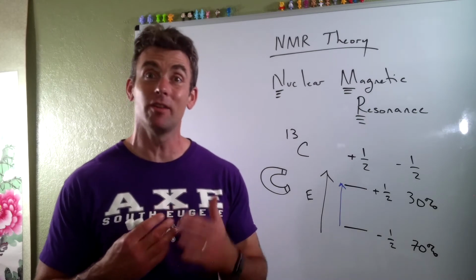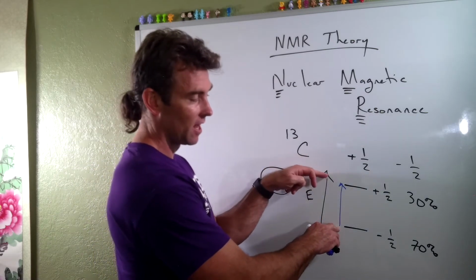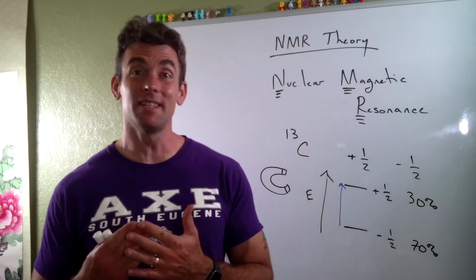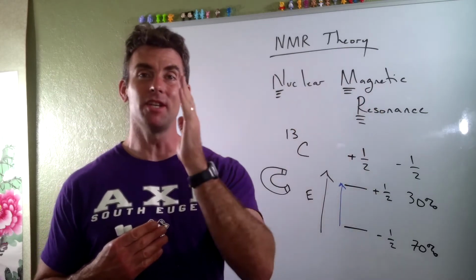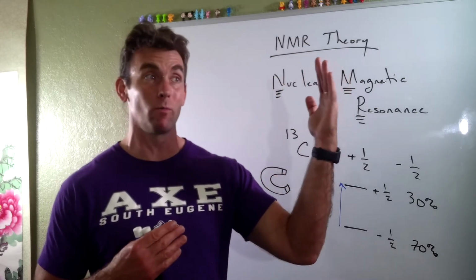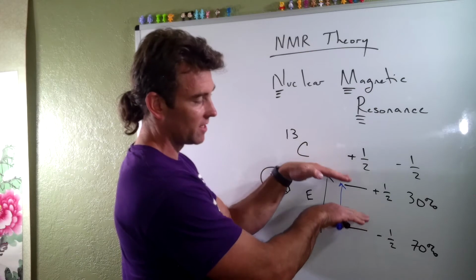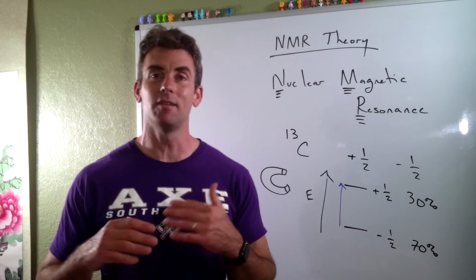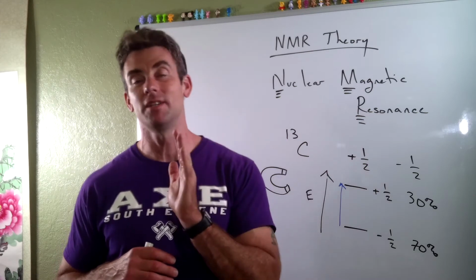And so that's literally the lines on those spectra that you see correspond to really particular energy differences between the spin states of carbons. This technique is so incredibly sensitive that on the horizontal axis that we see, the position of that energetic resonance at a really particular point corresponds to a really small variation between these different energy states. And there's different things depending on your environment that will tend to make you either in one position on the spectrum or in another position on the spectrum.